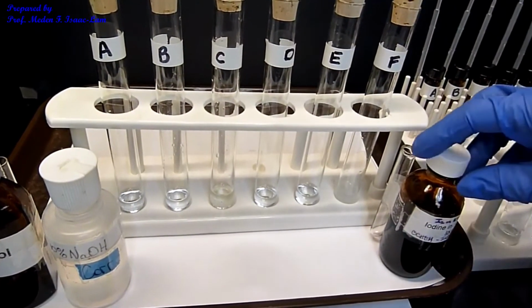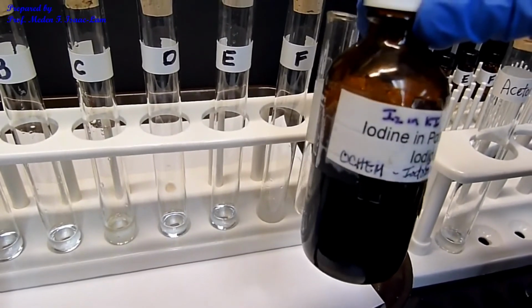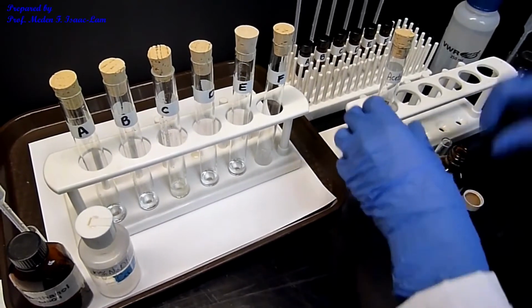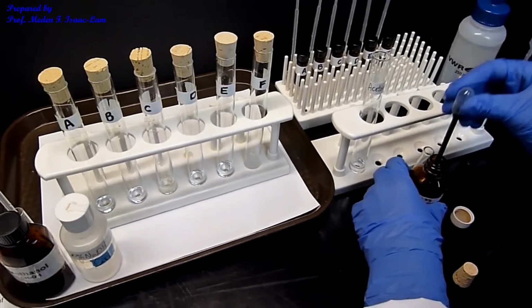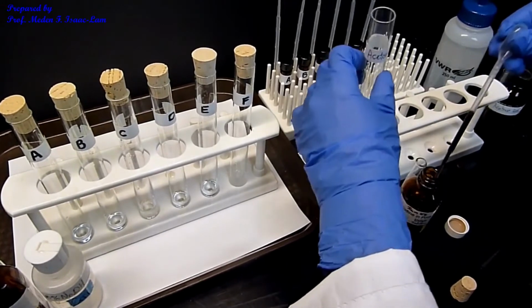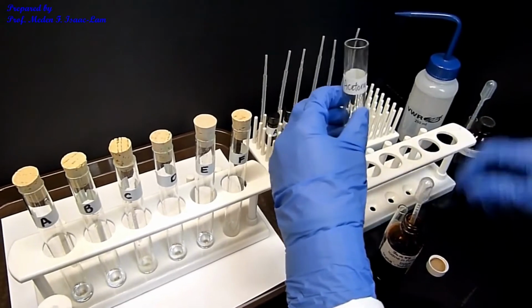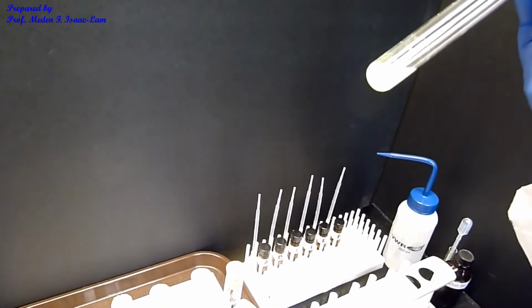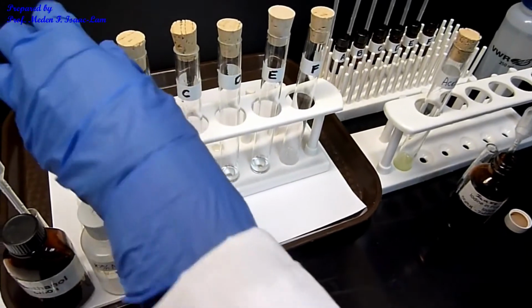I am now going to add the iodine in potassium iodide. So this is the iodoform reagent. I will do first the standard, which is the acetone. So I added about 10 drops. So you can see the yellow precipitation of iodoform already. So that's the positive test. And now, so I added 10 drops.